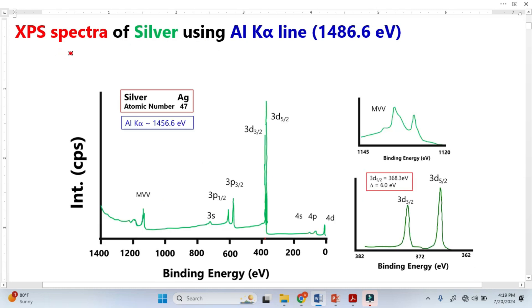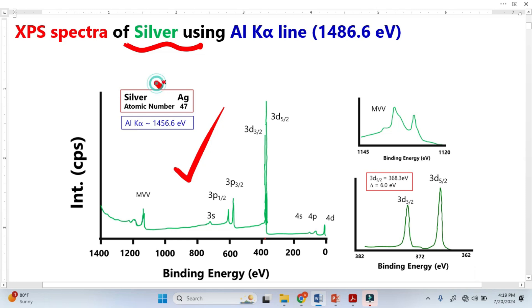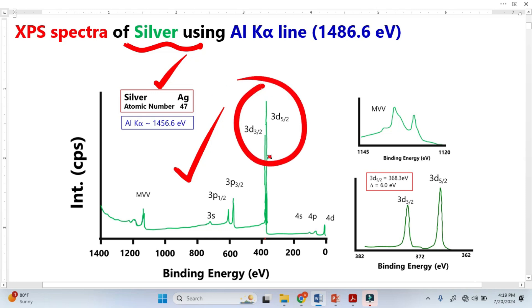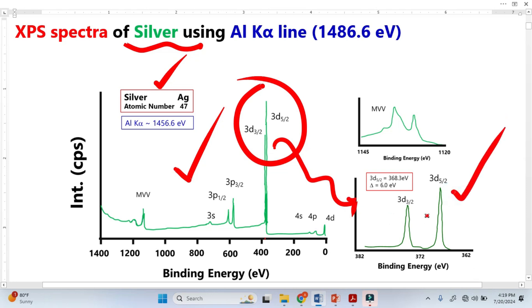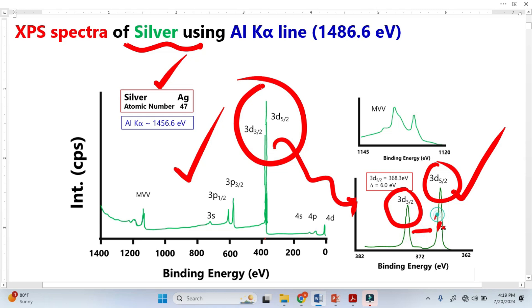Similarly, this is the standard XPS spectra for silver and this is the survey spectra. From the survey spectra, we simply identify the type of elements that exist. Now we have to focus on the most important peak — we cannot see these two peaks separately, so we have to resolve them. Once we resolve this peak, we get this type of result, which we call the high resolution XPS spectrum. We can clearly see two types of peaks and we can now find the area under these peaks.